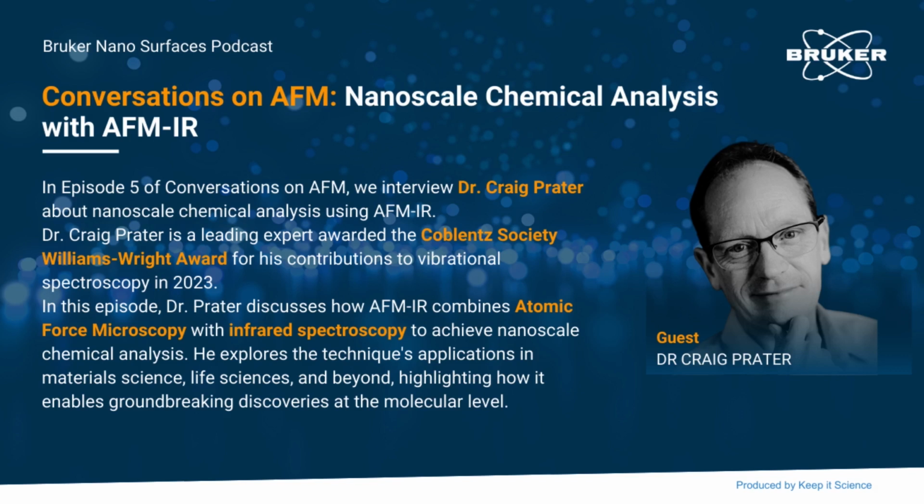But the big advantage is it's a much simpler approach. So AFM is an extremely powerful technique, but it's also a very sophisticated technique and requires a certain level of sophistication by the user to get the best results. And the OPTIR technique, while it has somewhat coarser spatial resolution, is more like operating an optical microscope, and so requires a lower level of user sophistication to be able to still achieve very useful chemical spectroscopy and chemical imaging.